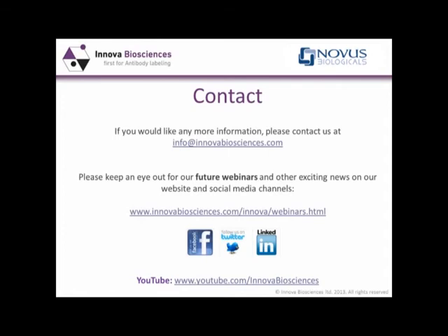Okay, the next question is, can I use PiBind to clean up phosphorylated substrates? Yeah, we have this question quite a lot. I wish the answer were yes, but the PiBind resin has a very, very high affinity for phosphate. It also has a reasonable affinity for things like ATP. So we can't really recommend that you would clean up phosphorylated substrates with PiBind resin. You really need good quality substrate.